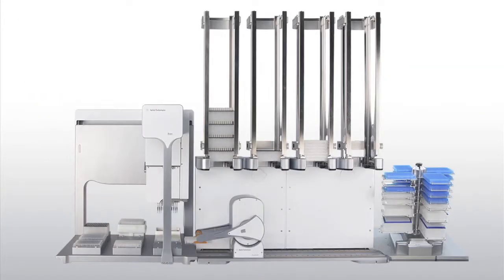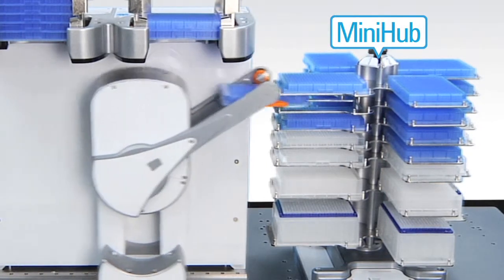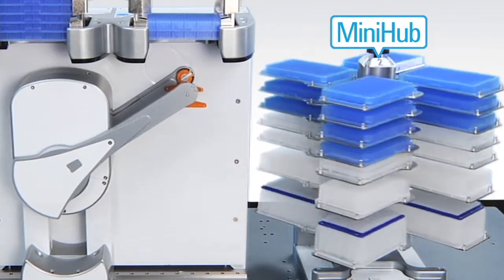Shown here is a workstation that integrates the BenchCell with an Agilent Bravo automated liquid handling platform and the Agilent MiniHub, providing compact, user-configurable, random access to plates and tip boxes.